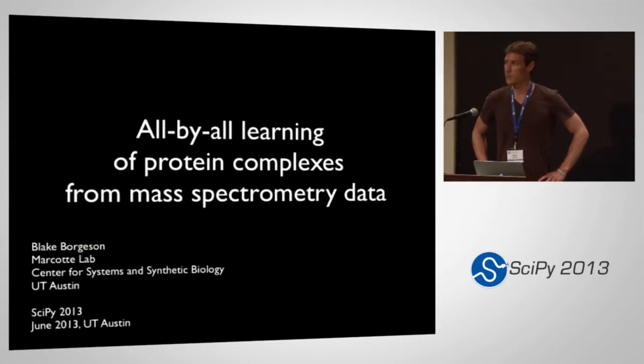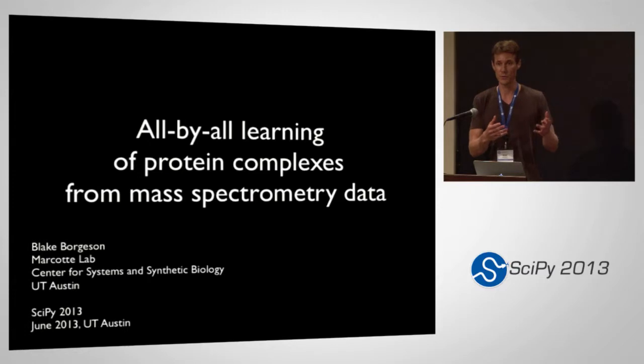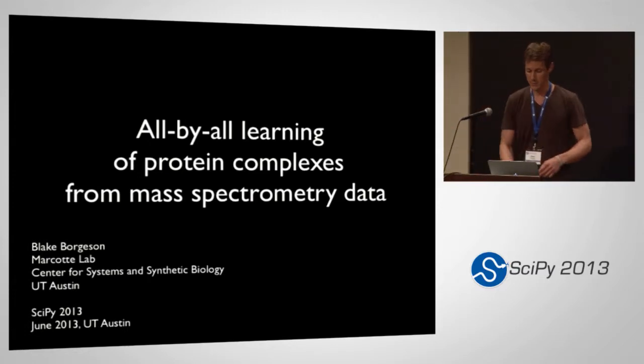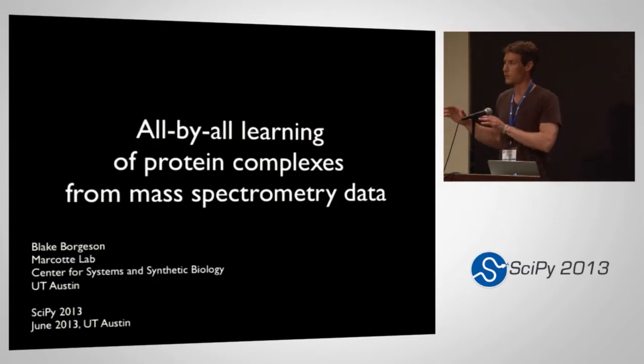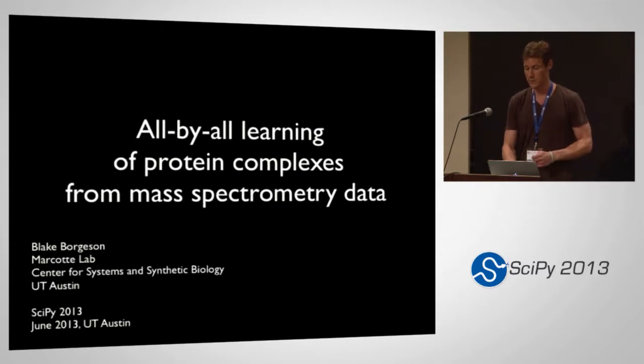This is going to be a little bit more of just a user case of Python and machine learning, just to show one way that it can be applied to a biology problem. I'm not going to talk about tools that I've written. I haven't written tools for bioinformatics. I'm just a consumer at this point, and I'm trying to take the tools that are being produced in the bioinformatics community and machine learning community and apply them to biology problems. So hopefully it'll give you a taste of one type of problem that all these tools are being used for. And I'll talk a little bit about how I'm using those tools.